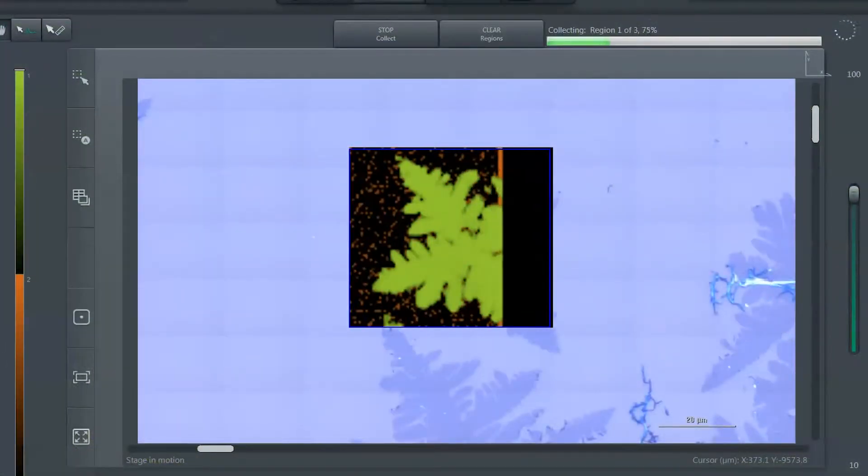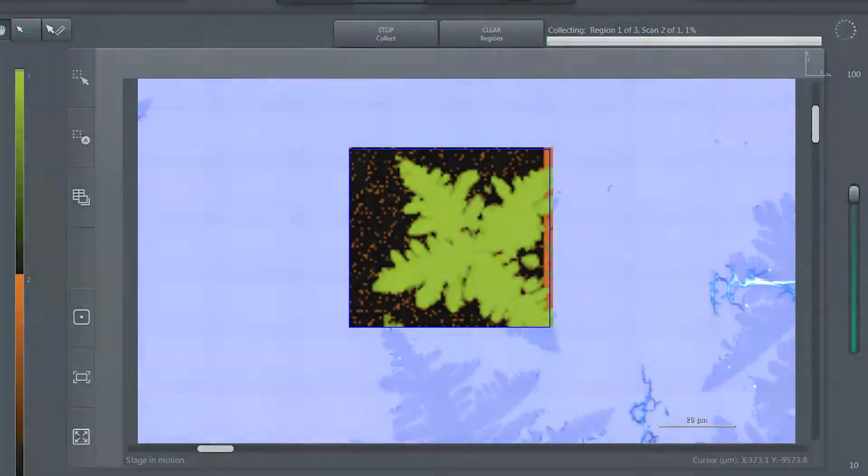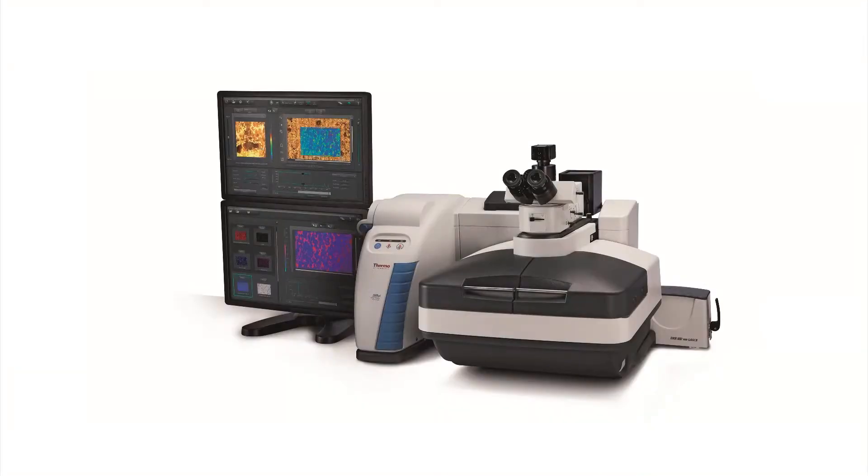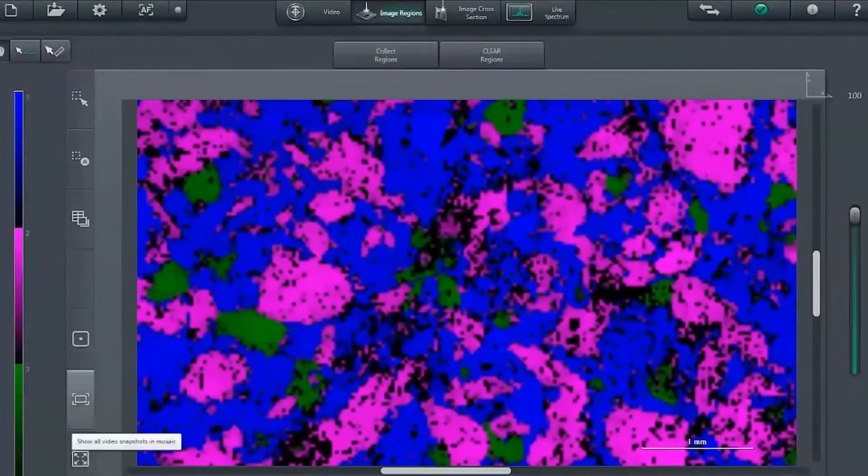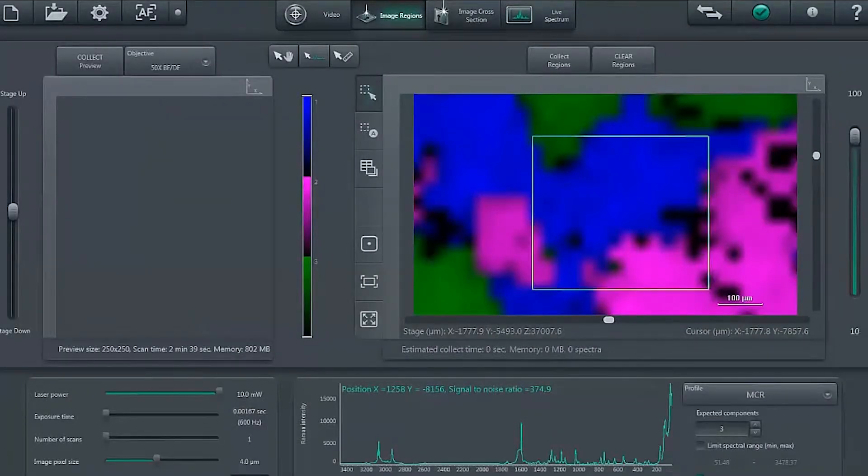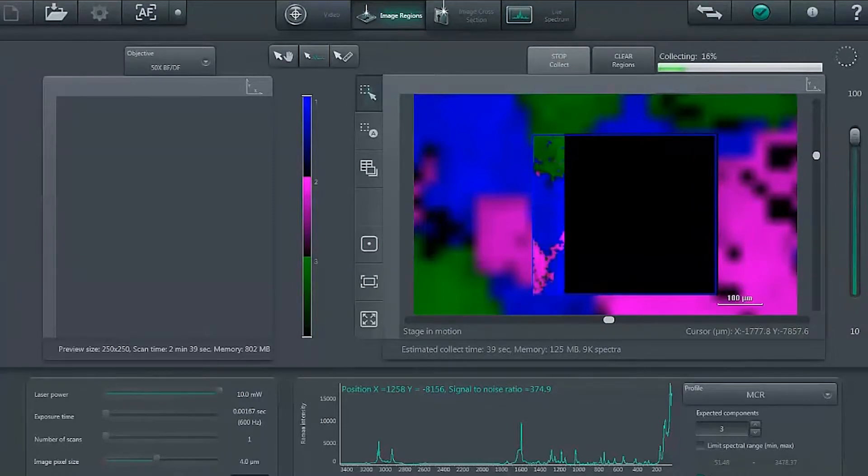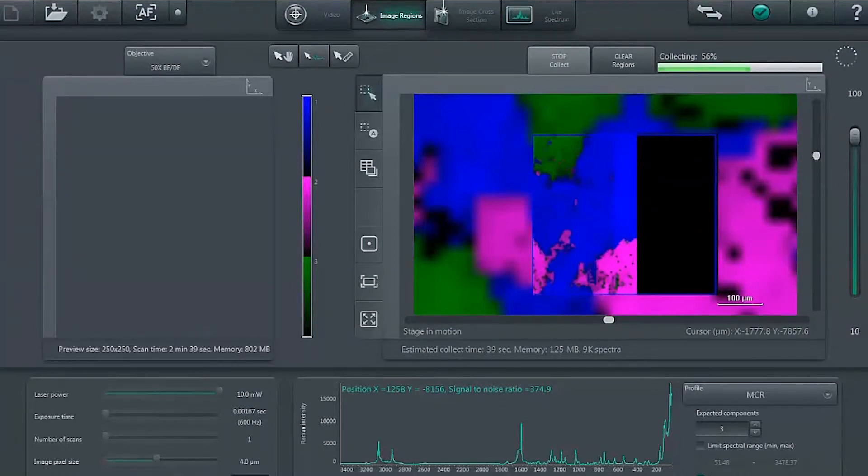It's also an ideal solution for pharmaceutical users looking at upstream formulation development, content uniformity, and distribution of polymorphs. We can image a whole pharmaceutical tablet in just a few minutes and get a real-time visual interpretation of data.